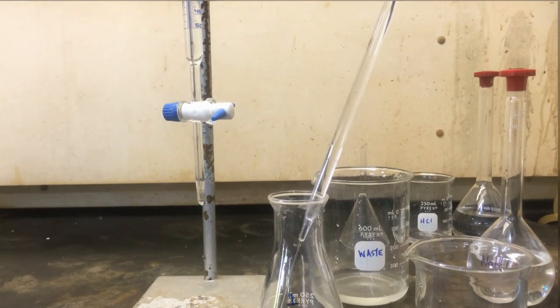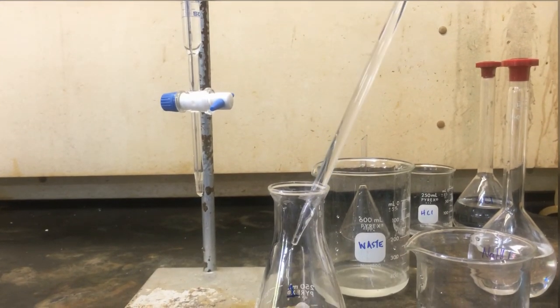Take note of how she uses the pipette. She slants it against the conical flask in order to obtain all the solution from the pipette.